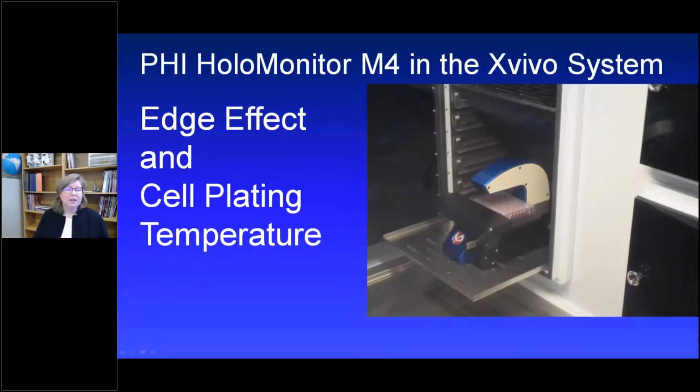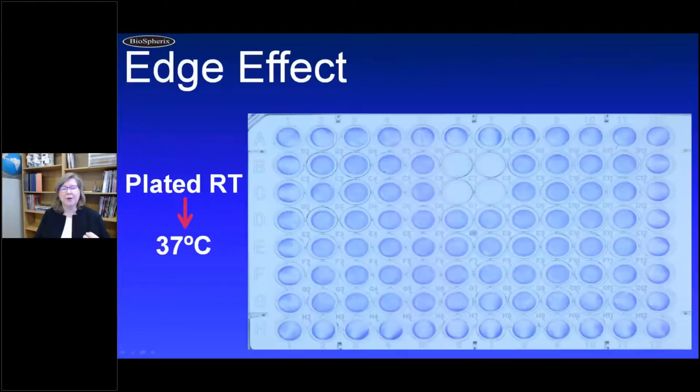We did a study using PHI's HoloMonitor M4 inside the Xvivo system, looking at edge effect and cell plating temperature specifically, because there was a paper that came out in 2005 that said if you just leave your cells in room temperature for 1 hour after plating them, that you could help get rid of edge effect. But of course, we know this is terrible conditions to be leaving your cells out in. So we wanted to see if we could get rid of that edge effect in a better way.